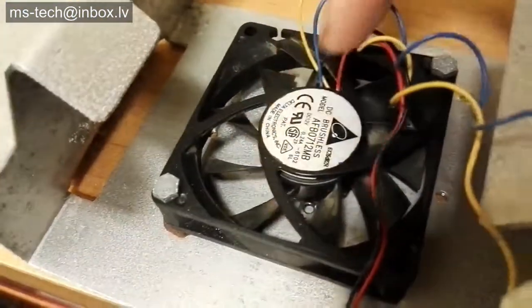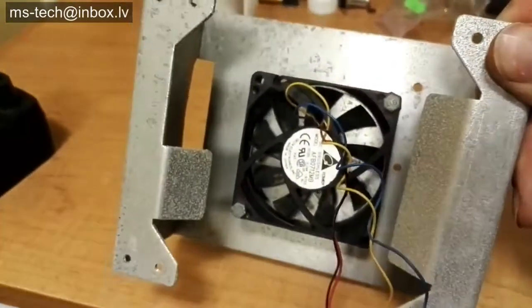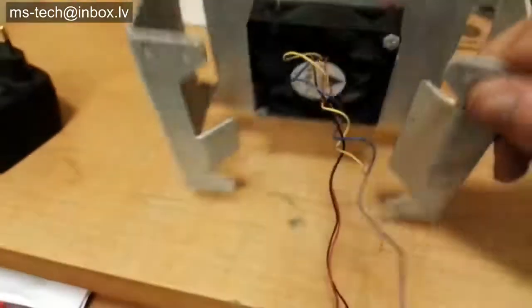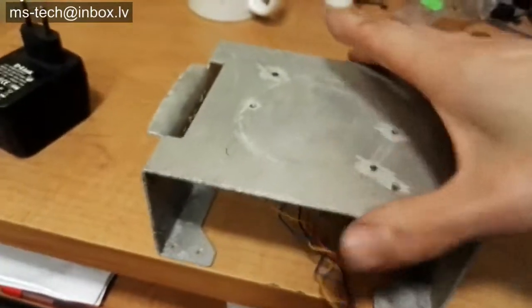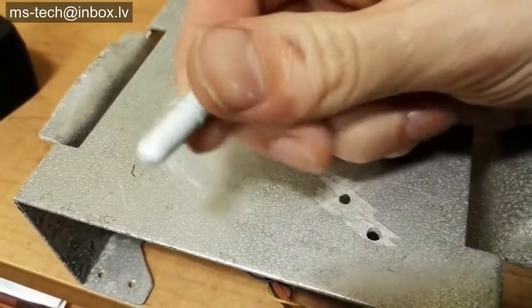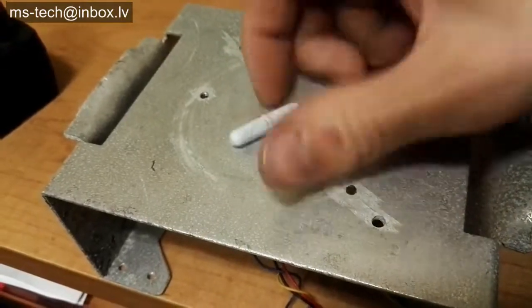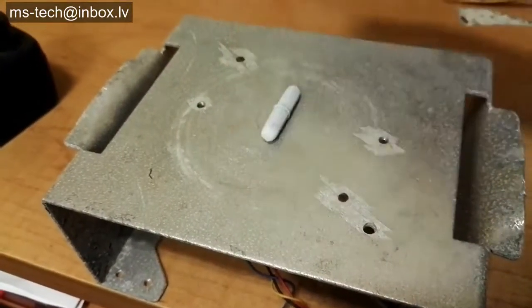The magnets will increase the profile of the fan, so you will need spacers before putting a flat surface on top. The spacers can be anything — I used coins initially. Eventually I snapped off a few pieces of spare plexiglass and glued them to the edges of the fan. Make sure the spacers are higher than the profile of the fan with the magnets glued on.